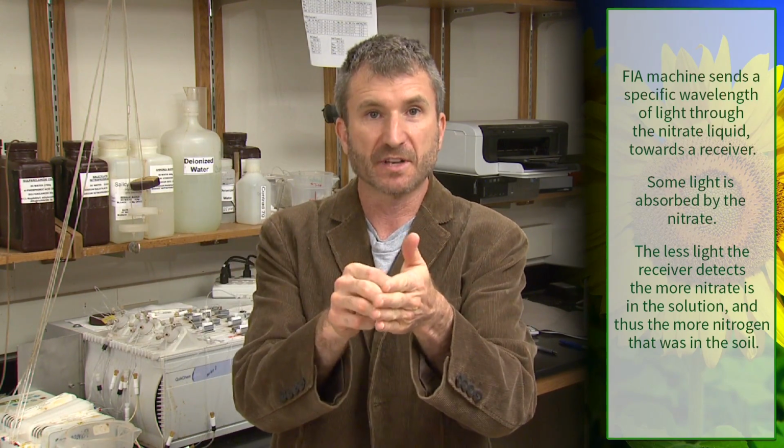It's going to take that liquid solution that contains nitrate, and bring it to a place where on either side there's an emitter of light and a receiver of light. The emitter is going to emit a very specific wavelength of light, and it's going to travel through the solution. The more nitrate that's in that solution, the more of that light it's going to absorb, and the less light is going to hit the receiver. And so it's basically going to measure the nitrogen content of the soil by how much or how little light reaches the receiver after traveling through the nitrate solution.